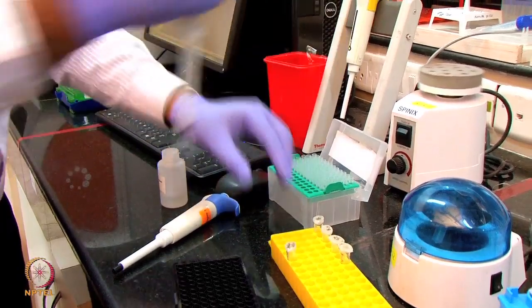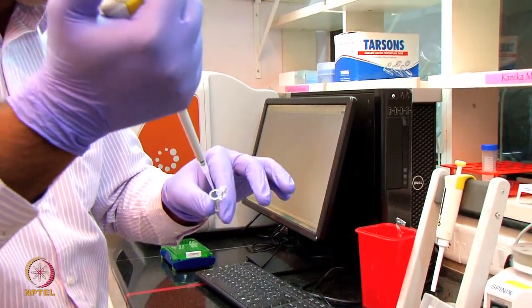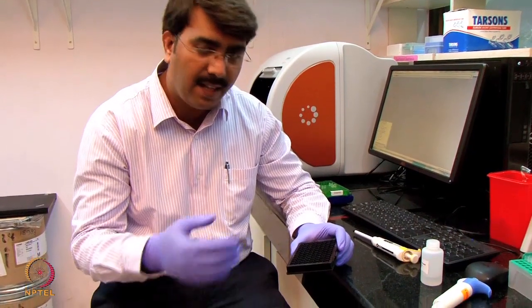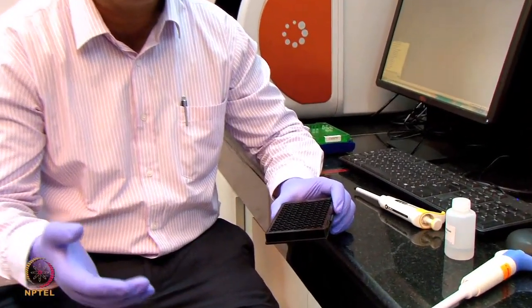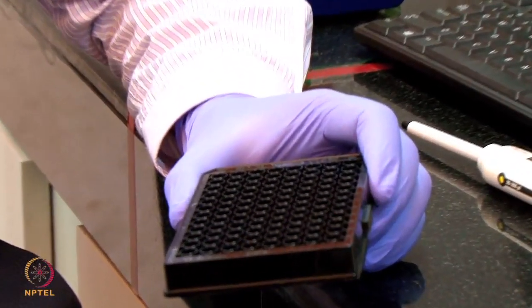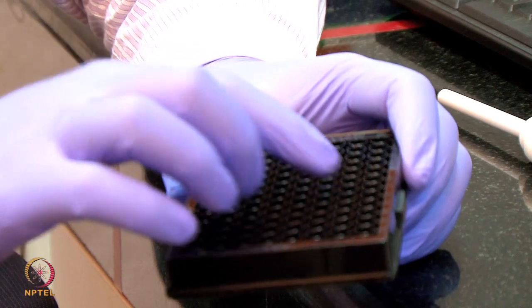Here, this is the 50 microgram per ml protein. I'm serially diluting, doing a 2-fold dilution in the plate. Now we have made 6 concentrations of the standard apolipoprotein, ranging from 1.56 to 50 microgram per ml. I put the standards from A3 to A8, with 1.56 in A3 and the last, 50 microgram per ml, in A8. I also put the reference buffer, which we use for the reference subtraction, at B6, B7 and B8.